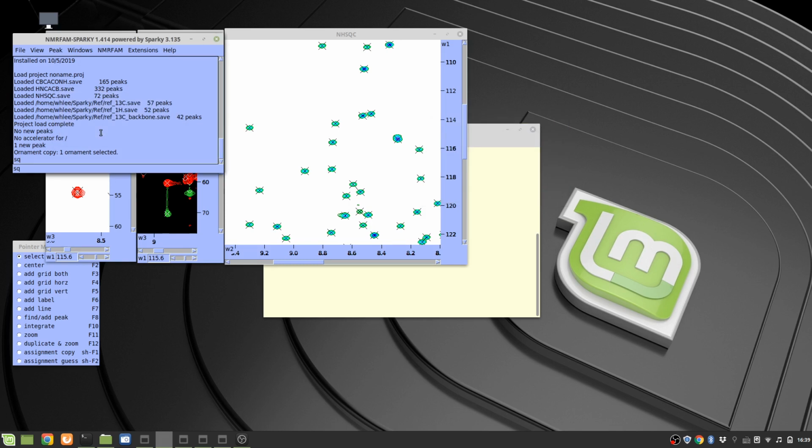So if you already have your project file name, let's say protein.proj, then the sequence file will be placed in the same place, named after your project file name with .seq added. So you will have an additional file called protein.proj.seq in this case.